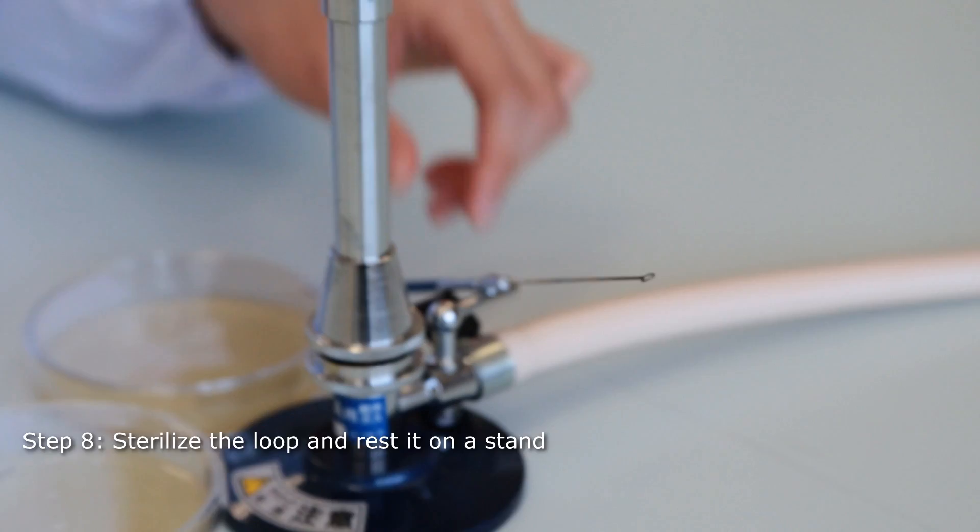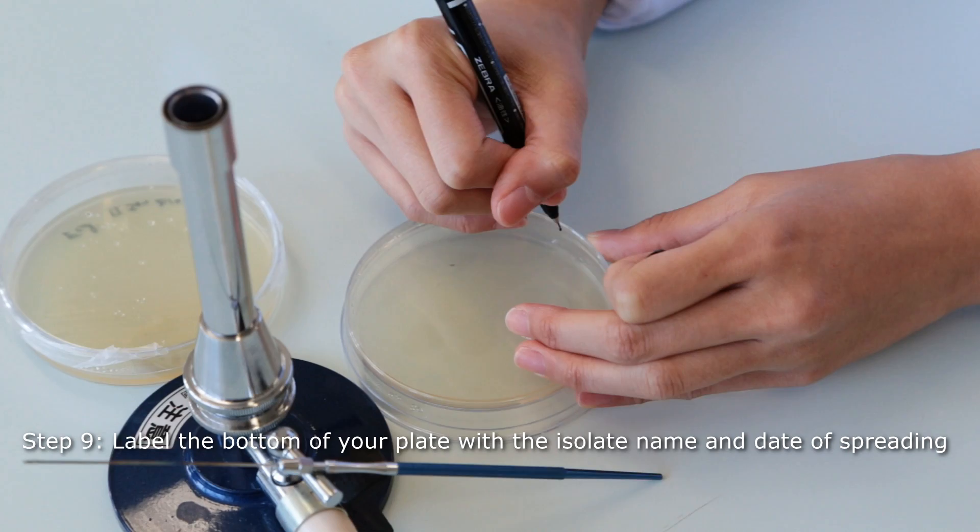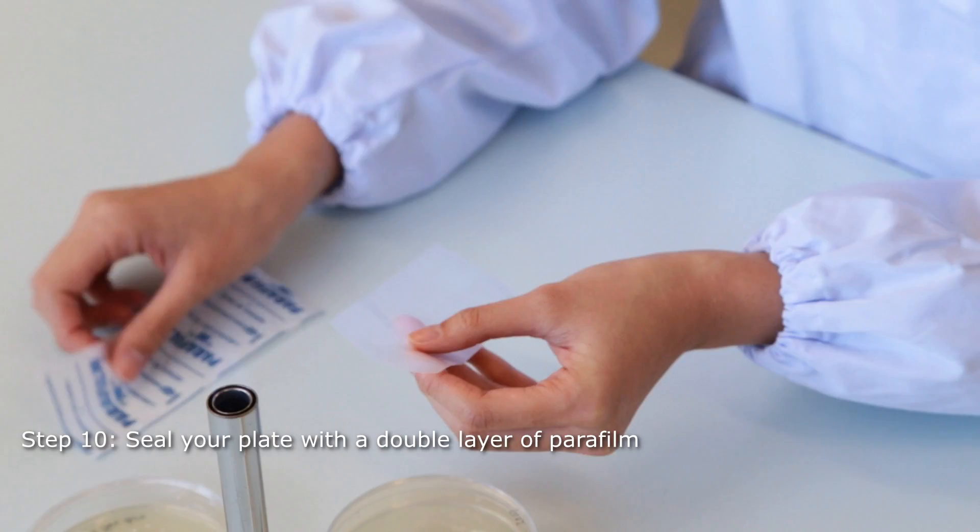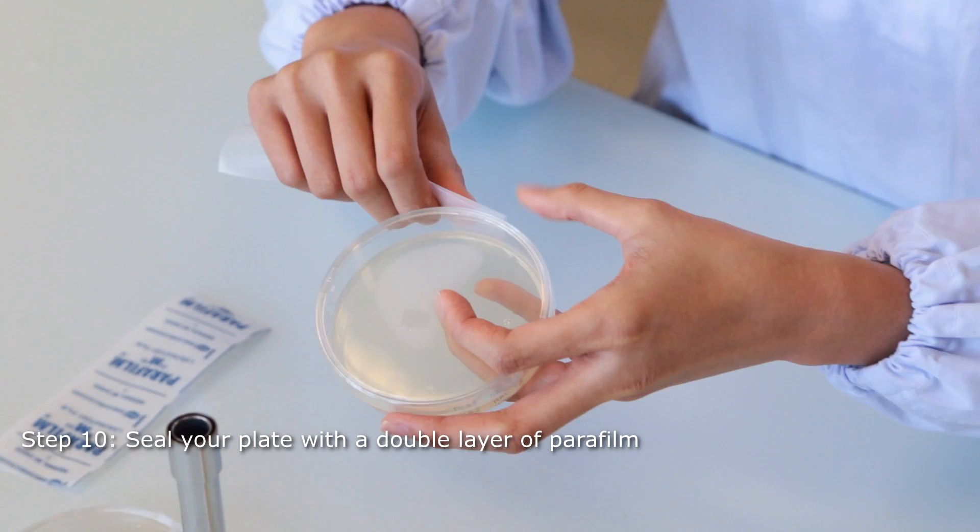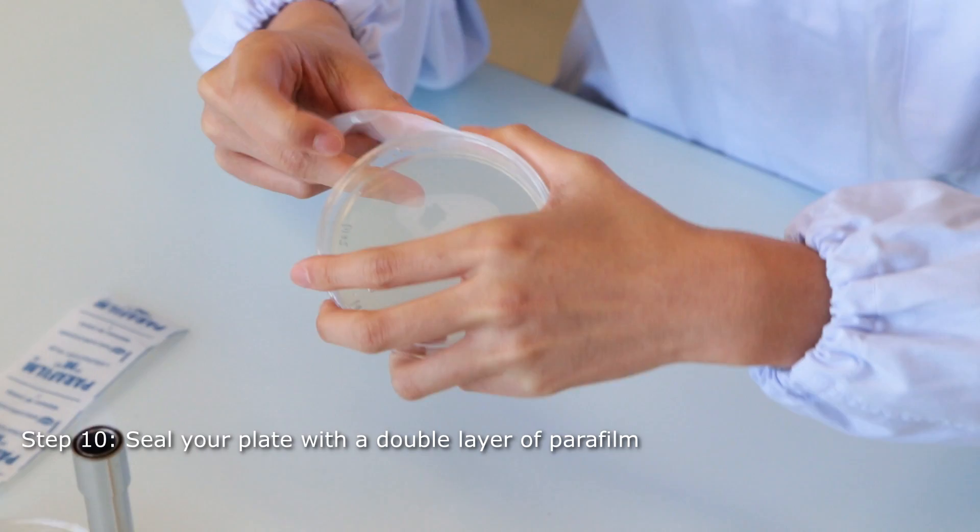Label the back of your plate using a permanent marker. Use parafilm to seal the petri dish in order to avoid excessive evaporation during incubation. Parafilm also lets gas through, which allows aerobic respiration throughout the incubation period.